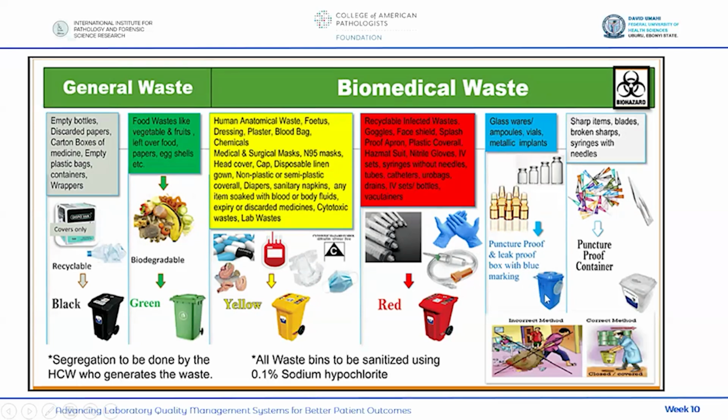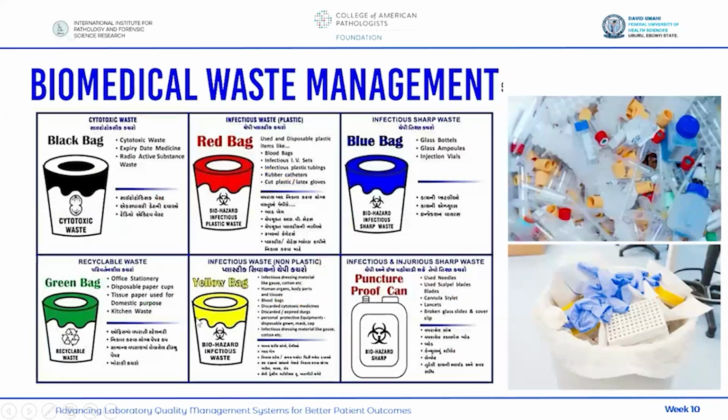They are still infectious, but they are sharps. So that is what the blue bucket is about. Then the green here says food waste, that the biodegradable waste can go into the green. But sometimes you see the green marked as recyclable waste, because we're going to talk about recycling. So if you look at this next slide, you see the green bag captioned recyclable waste. Okay, so that is basically the color coding for waste management. You have blue, red, black, yellow, green, and then the white sharps box.